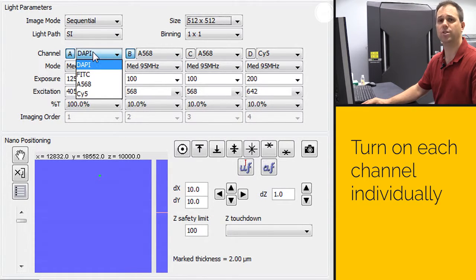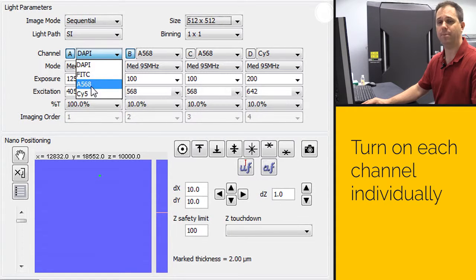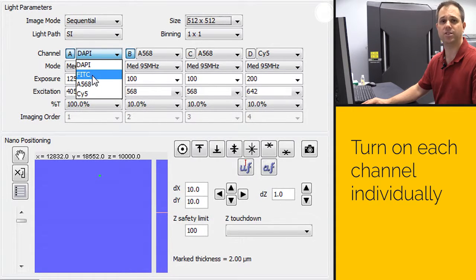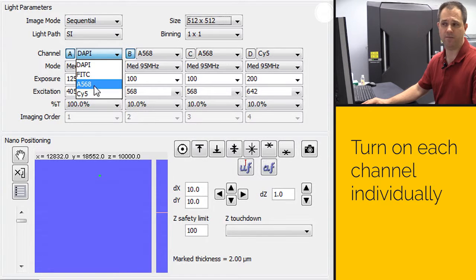You also have the choice of what dye you want to image in that channel. Your choices are dappy, fitzy, alexa 568, or psi5. So in other words, near UV, green, red, and far red.